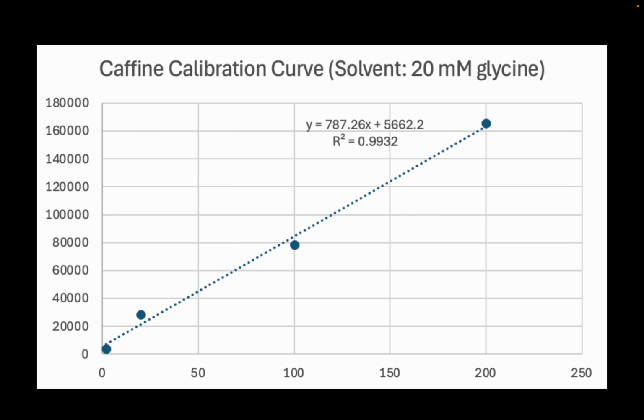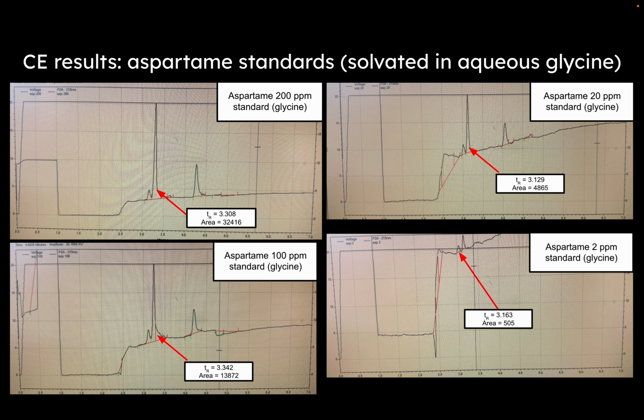And it gave me a decent R², more realistic, right? The last one, when it was in pure water, wasn't great. When it was in this, it was a lot better. Okay, aspartame, looking at that now, really great peaks here. I thought they were pretty good.